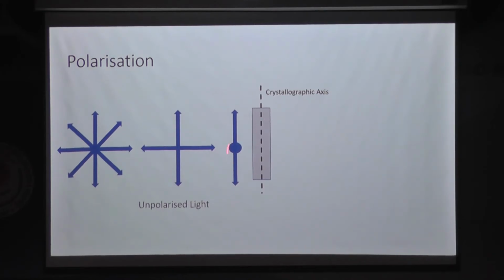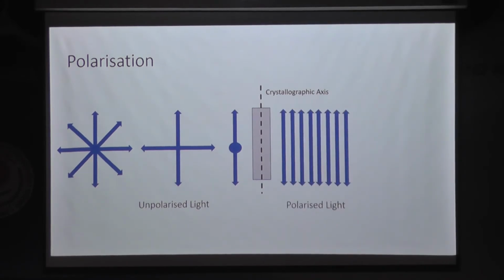So what happens in this birefringent component, this particular crystal, is it will allow only one single plane of light to be propagated. Now, these all three are unpolarized light, but when the unpolarized light passes through this, it gives the output. This negates this.